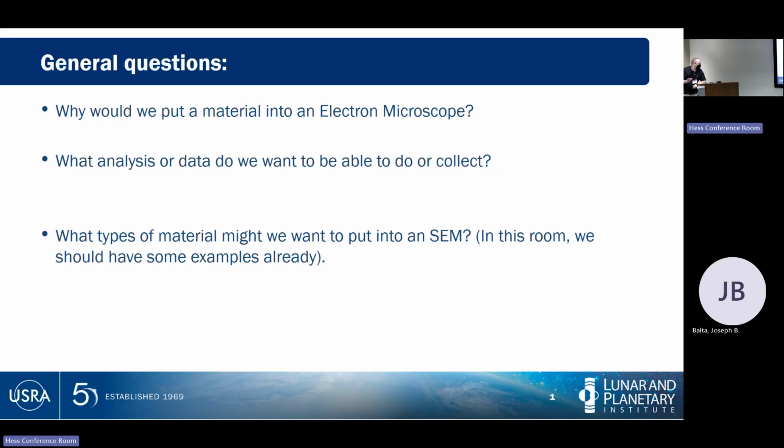So notice what I'm doing here. I took the example of the weird sample, no offense, that we have out of the group and said, okay, let's start running through what can we analyze, what would be a real challenge. Let's make sure we understand the properties, and then start getting to what the analysis that we do will actually get us.